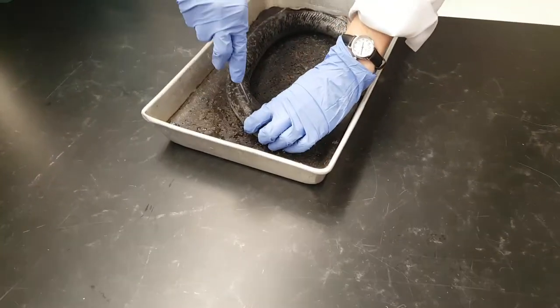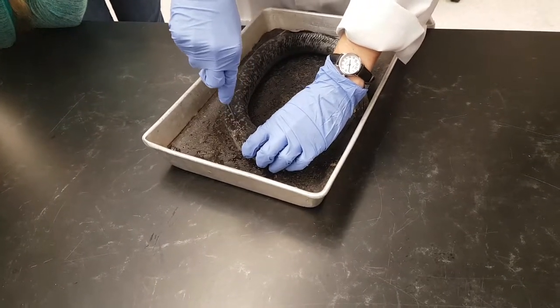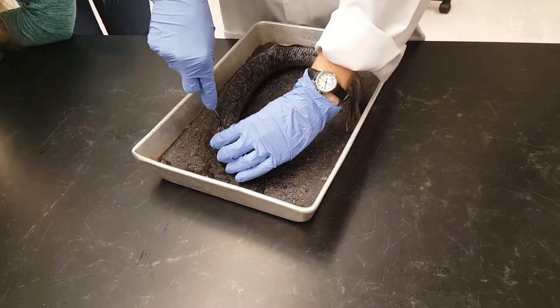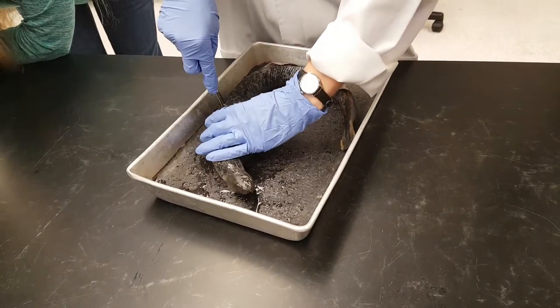And you just basically cut all along, straight along the dorsal line. Make sure that you go all the way through so that you won't have to go back and try to cut through it again. And this will make sure that you keep your cut straight even as you try to go back and look at the different structures.